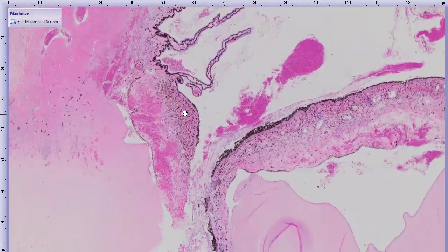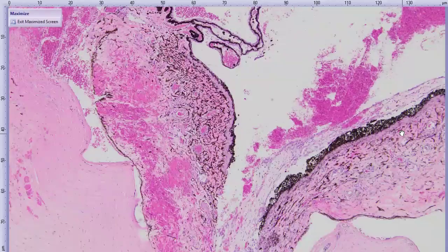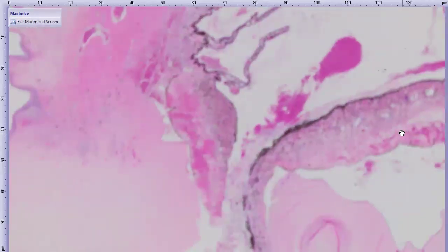Anyway, so what I also pointed out on low mag was that there are areas of iridal stromal hemorrhage, and that is not necessarily a common finding in many globes, but we can see it in certain situations, including trauma. Sometimes, especially in older cats that have hypertension, you can see iridal stromal hemorrhage that's related to vascular disease. But other than that, it's actually relatively uncommon. So it's sort of a unique feature of this case.